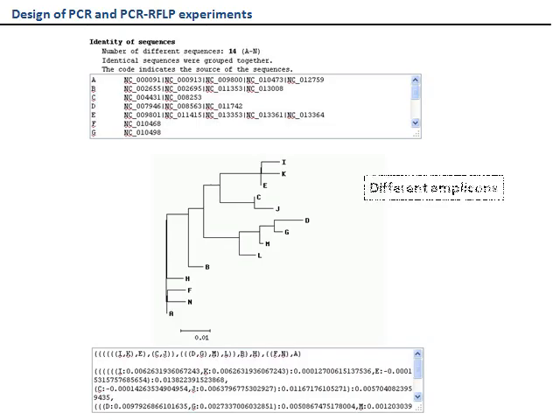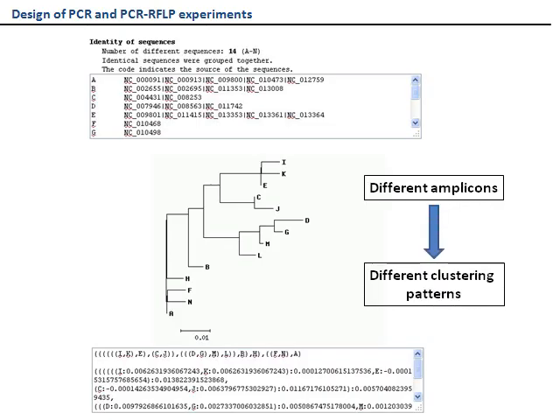It's worth pointing out that the clustering patterns may group the genomes very differently when the experiment is performed with amplicons from different genes. Consequently, comparing results from different experiments allows us to understand the weaknesses of the methods that establish relationships among genomes by searching only one short sequence per genome.